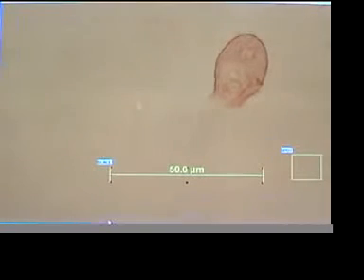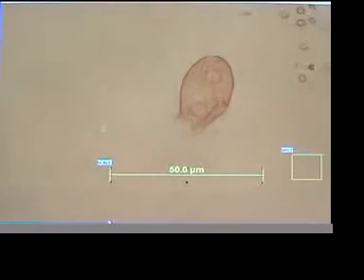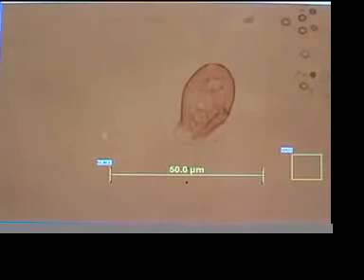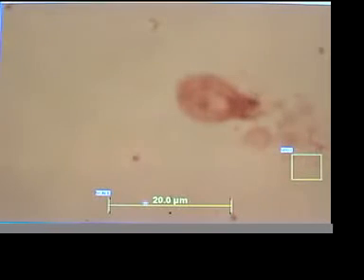Alright, here we have what appears to be my first hit at 927 Hertz. I've never had one at 927. Let me adjust the exposure level a tad. Something is definitely happening to this guy, or already happened. Oh, I see, yeah, I see the spheres below him. He already broke up. This is what's remaining. And we have another one, if I can focus fast enough. There he is.